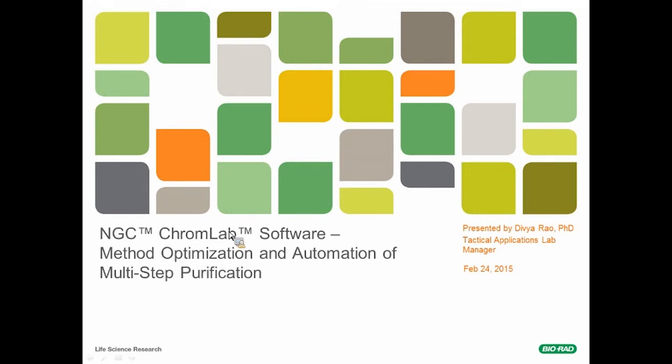The goal of today's webinar is to understand some advanced tools in the software that aid a chromatographer in optimizing purification processes in a systematic, automated, and timely manner.